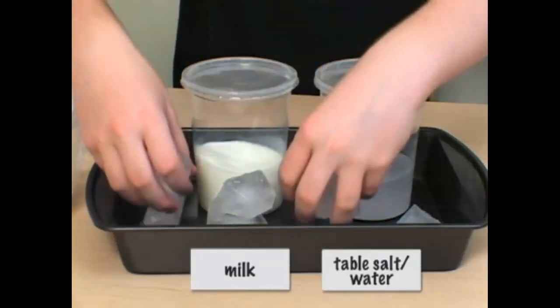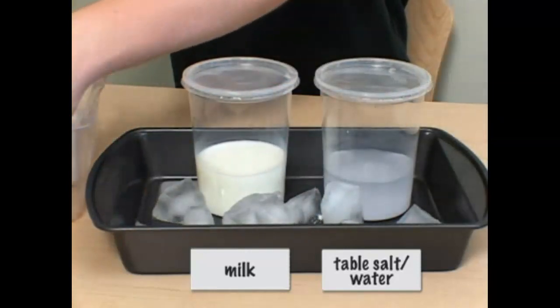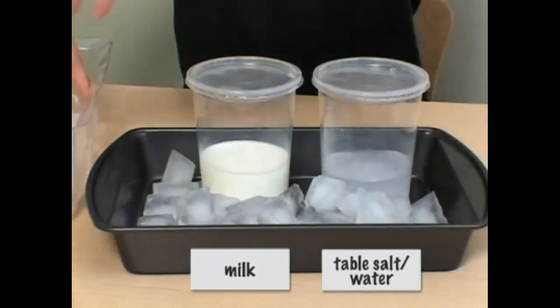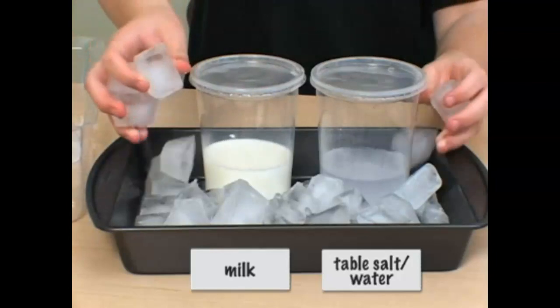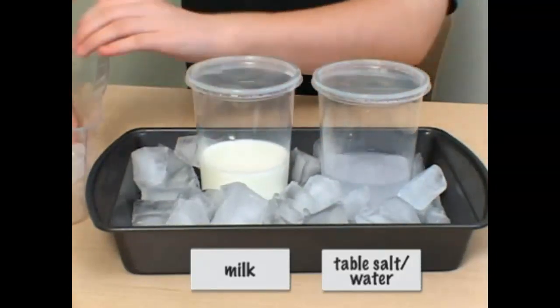Finally, we tested to determine which mixtures are solutions. Components of suspensions will settle to the bottom of a container. The bottom of the container will get cloudy as the top clears. Solutions will not settle. However, the solid components of the solution will settle out of the solution if you cool it, and go back into solution if you heat it.